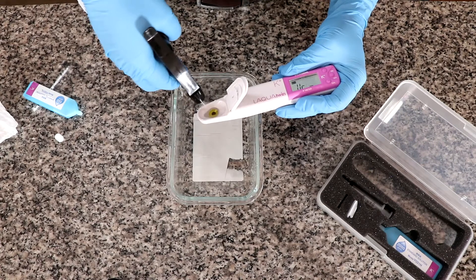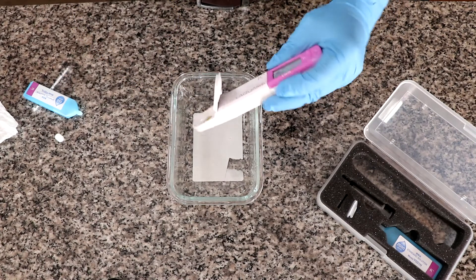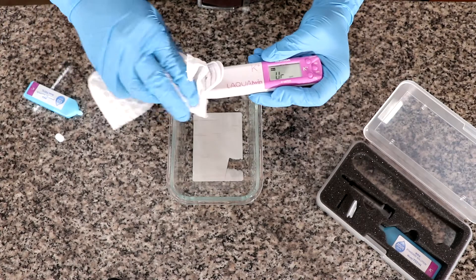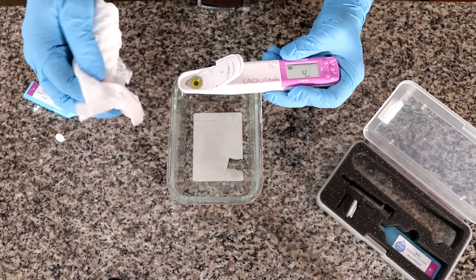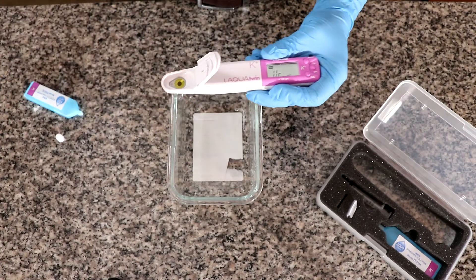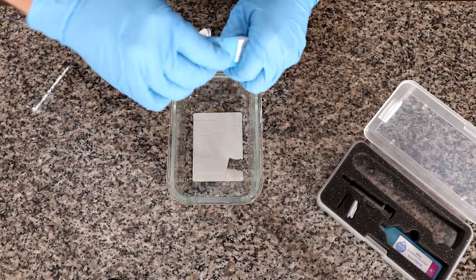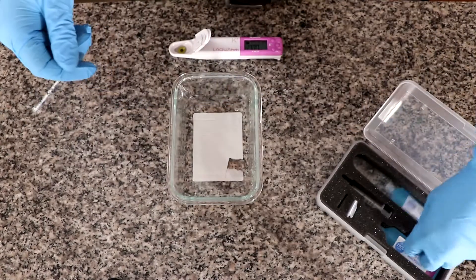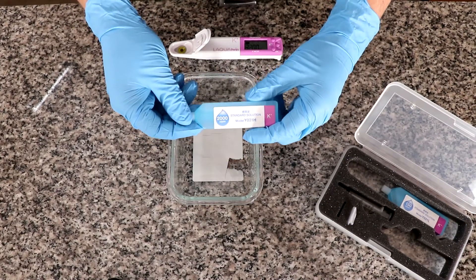Now for the second calibration point I'm going to clean again with distilled water. Now again I'm going to gently tap the electrode to get rid of as much of these droplets as I can. Now I am going to close the 150 and I'm going to get the 2000 ppm solution.